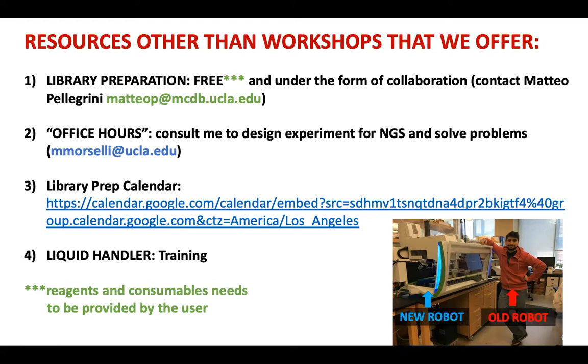Also, I have a library preparation calendar. And if I remember, I'm basically adding the library preparation that I'm preparing at the moment. So if you want to tag along and learn, you can always do that. It just has to be according to my schedule. I usually cannot accommodate your schedule very much. Also, we have a liquid handler in the lab, and you are welcome to use it.